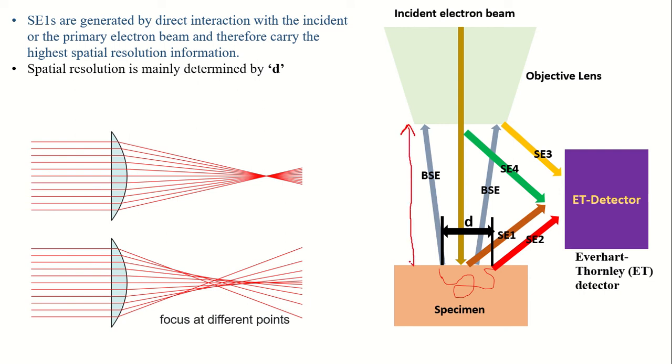This is the working distance. The working distance is the distance between the aperture and the specimen surface. All right, let's talk about the spherical aberration. Here in this image, you can see this is a lens and this is light which is coming and strikes the lens. All the light converges at a particular point. This is called the focal point.